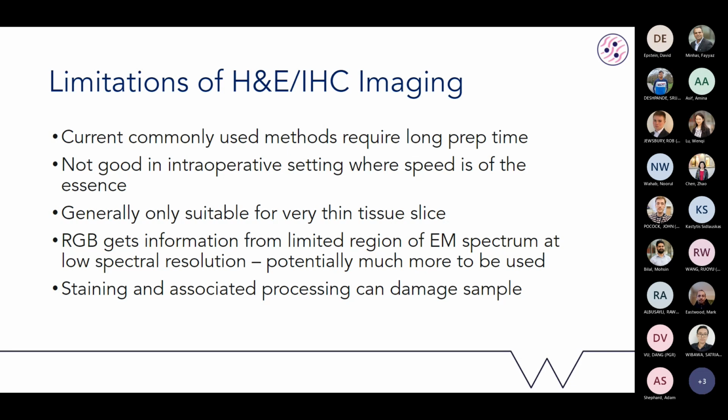So I'm wondering, most of the time when we try to measure something, that means we want to try to see something, right? So what would happen if we want to explore the region outside of the visible spectrum? If we can't see it, does it carry any meaning to us? Well, potentially the information there can be used to inform a model which you then visualize with a heat map or something.